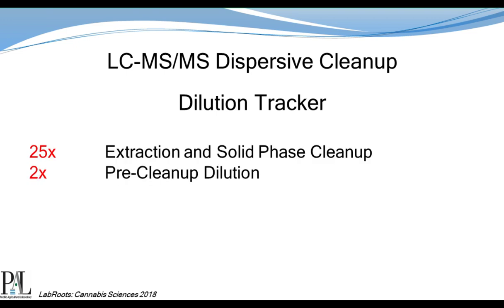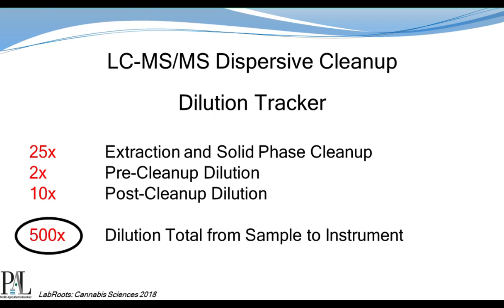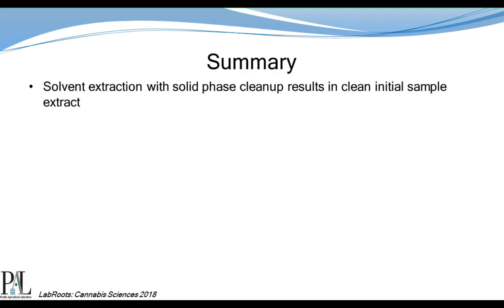We'll take another look at it. 25x from the extraction and solid phase, 2x before we do the methanol-assisted cleanup, and then we do another 10x. So we're right back at that 500x dilution from sample to instrument.